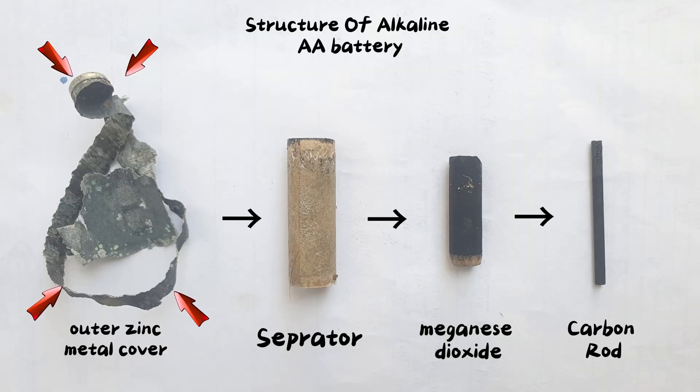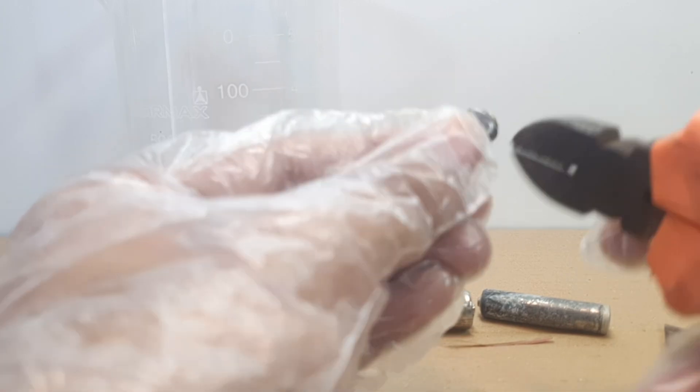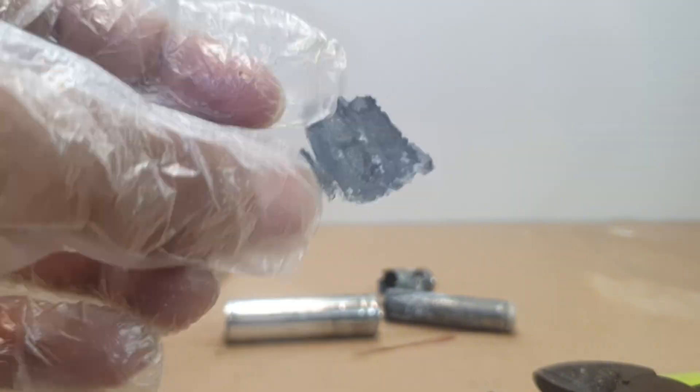We basically need this zinc casing for this reaction. Remove the outer zinc metal casing of the cell. A few minutes later.